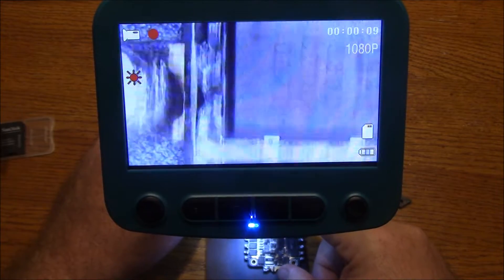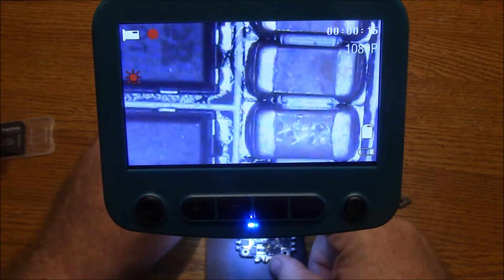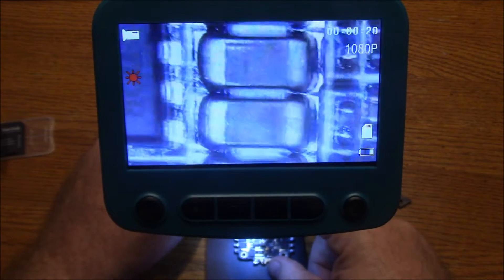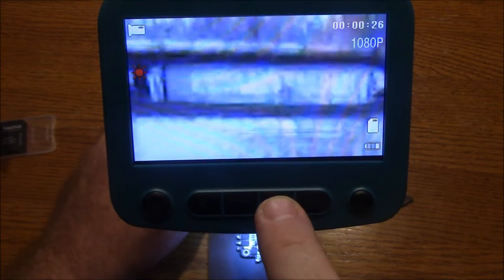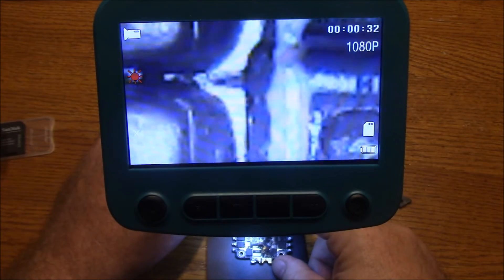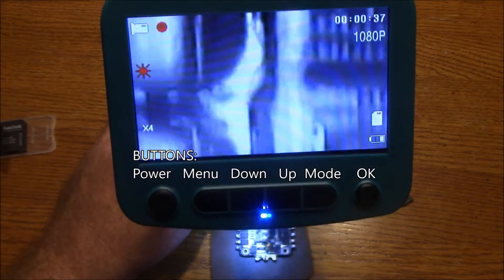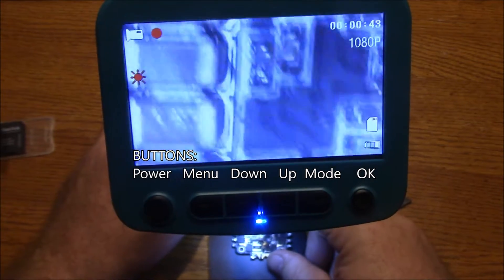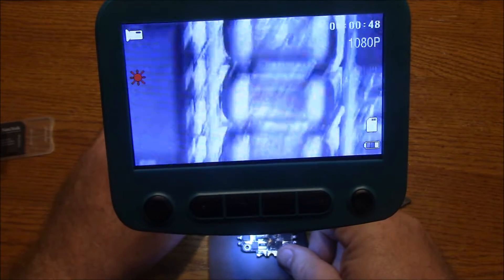So now we can move this around and look at some of these joints. This would be good if you're trying to solder something real small, or look at anything that's real small. You can push the up arrow and it will zoom into two times magnification, and then up to four times magnification. Now it looks like it's just doing a digital zoom, which is okay — I'd rather see it be doing an optical zoom. You can't go in any more than four. Push the down arrow and it goes back down to two, then back to normal. Most of the time this is probably going to be good enough, especially for soldering.